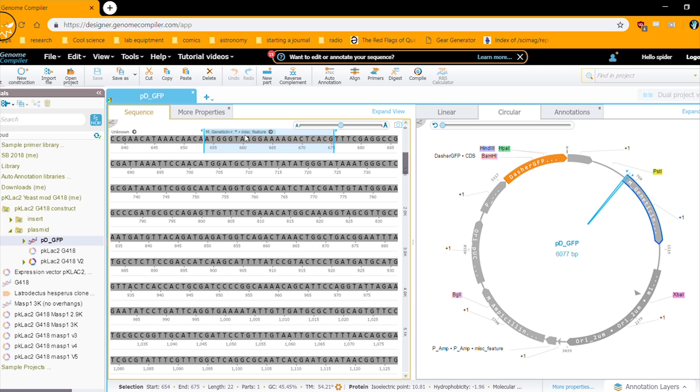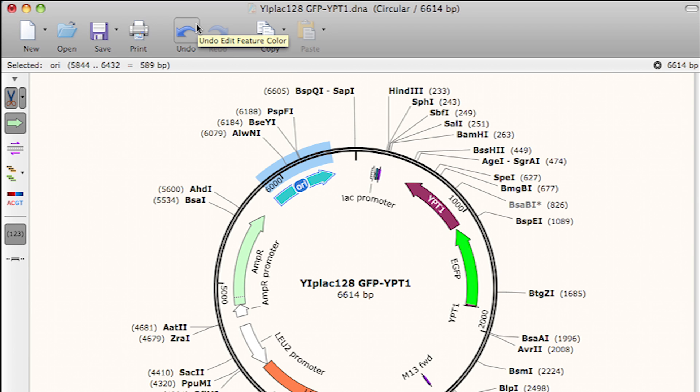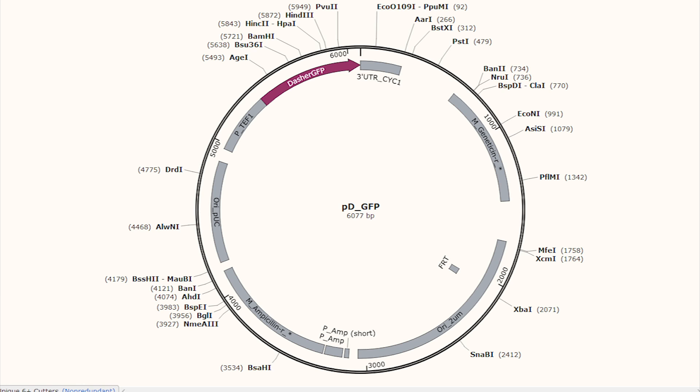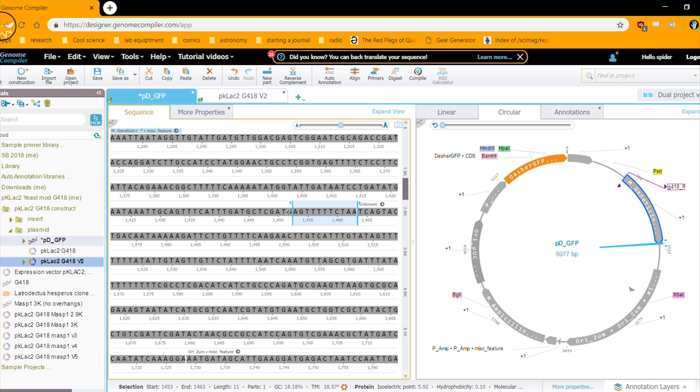To do that, I'm using an online tool called Genome Compiler, though there's other pieces of software that'll do the same thing. I just like this one because the UI is nice and it's free to use. Another common software is Snapgene, but the license for that is rather expensive. To get started, we need to load in the DNA sequence we'll be working with. In previous videos, I've shown these, which are plasmid maps. Basically, they're the zoomed out versions of a piece of DNA that's been labeled so you know what everything is without having to look at the individual letters. Think of it like an overview of a computer program. I've already gone ahead and loaded in the GFP yeast plasmid we looked at in an earlier video into Genome Compiler.